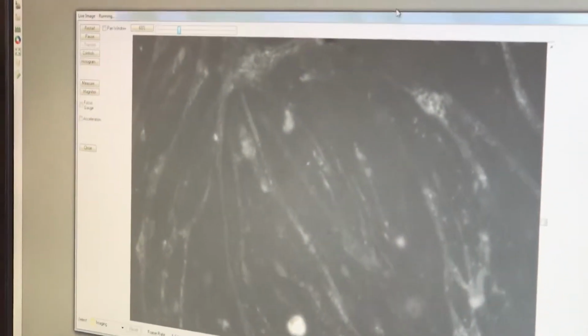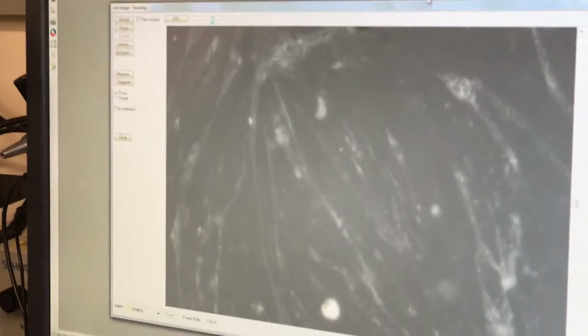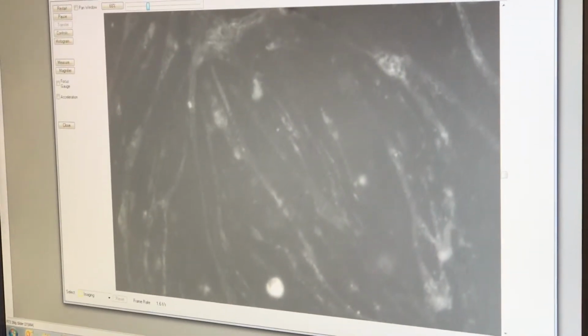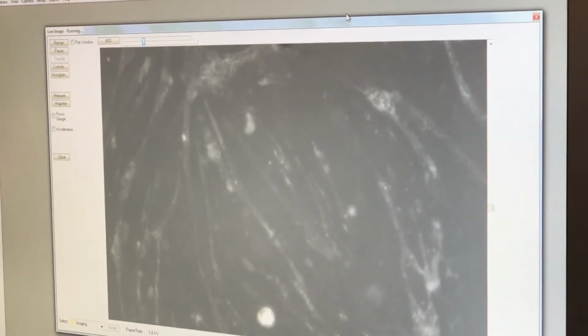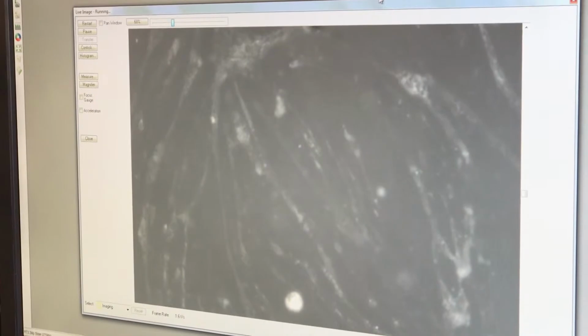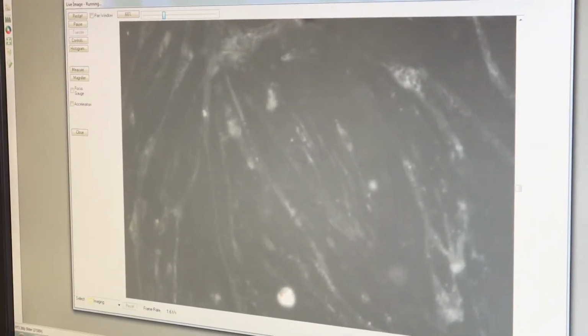Most of the time where you're going to see DUX4, let's see if Hossein can pull up his RNAscope. Hossein has been working on a method that lets him look in the cells. It's an in situ hybridization method. That basically means he's staining the RNA, so he can find where that DUX4 message is being expressed.